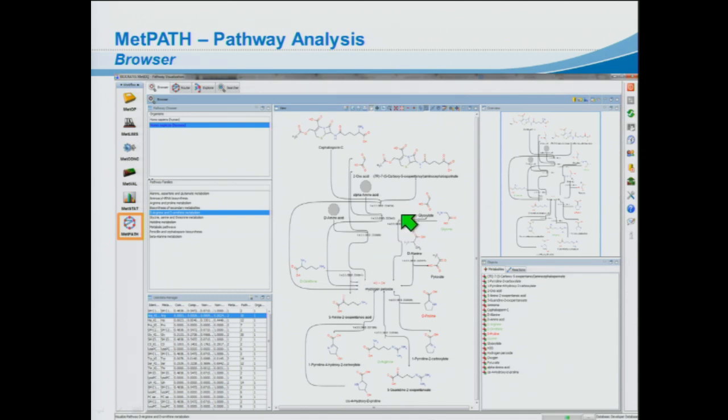Please note that this is not a static image that we generate here. It's really a live rendered graph which you can move and change, and you can hide nodes and export to images, and you can also hide the structures so that you only see the names to get a better overview. There are a lot of manipulation possibilities.